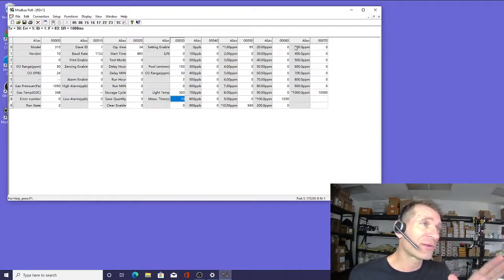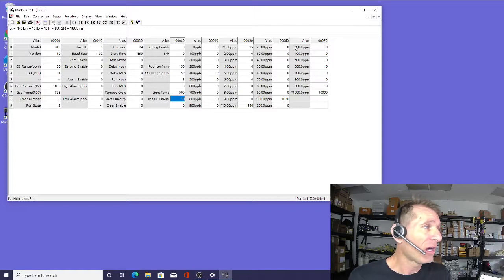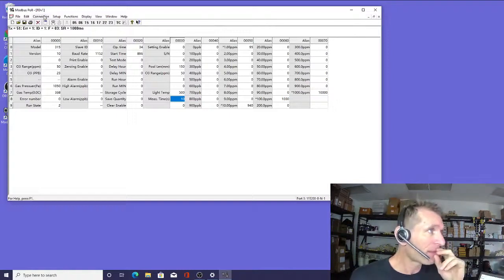Do not touch those, folks. Please do not touch those. If you do touch them, the analyzer will get out of whack and out of calibration. I suggest only the professionals at Forensics Detectors touch those. So that's the landscape. That's how we do it, folks.